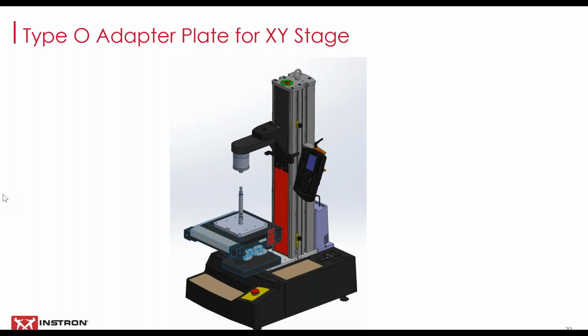So as far as installing the XY stage, it's really just a few bolts to secure it to the base of the system. The stage and the mounting, however, are quite heavy. However, you can leave it installed and run non-XY tests. So once you install it on the system, any other manual test that you need to run, you can do so with the XY system in place up to 2 kilonewtons.